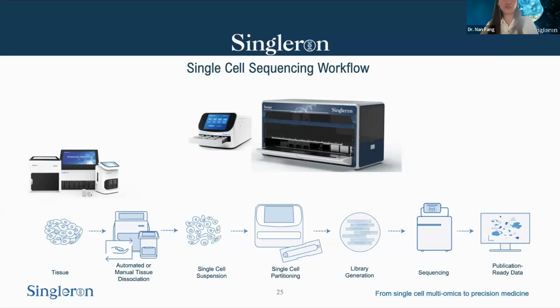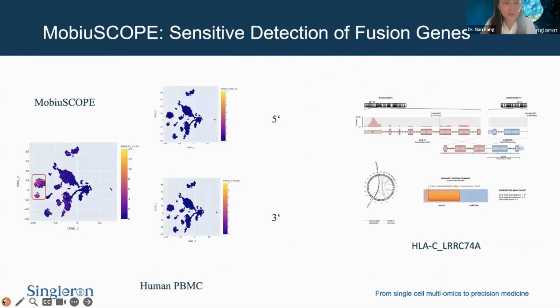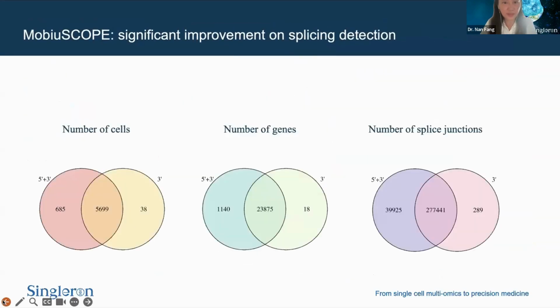Because when we generate a sequencing library, you always see a little bit like a Gaussian distribution. It's never one very distinct size of the library. You have maybe a median size of 500 something, but you do have a distribution. Meaning that from the sequencing libraries, we actually get pieces that are of different distance from either the 3' or 5' ends. That's how we could also piece together the information of the RNA at different positions.